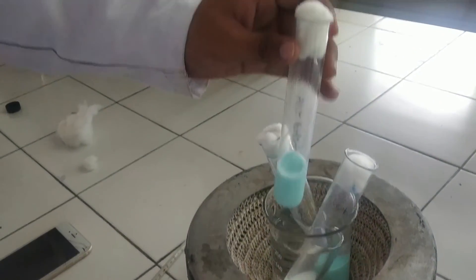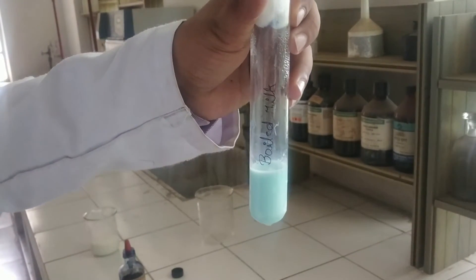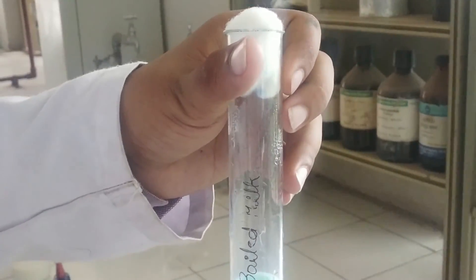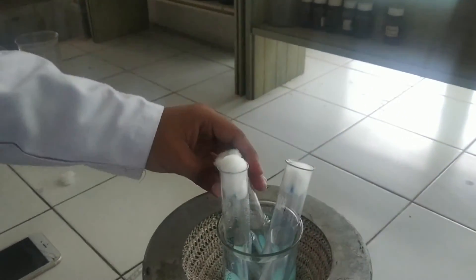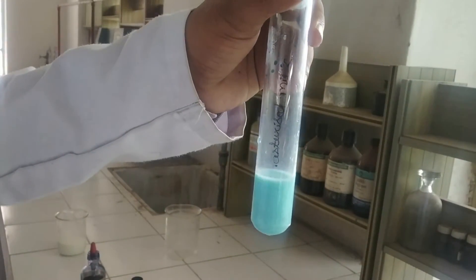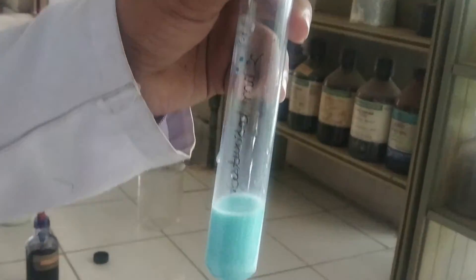The other sample is the boiled milk sample. The presence of slightly heat-resistant bacteria changed the color from dark blue to light blue in this boiled milk sample, meaning it is a fair quality milk sample. Now the third sample, which is the pasteurized milk sample: the color of the pasteurized milk sample has not been changed, so this is the milk sample which contains no microbes or negligible microbes, which cannot reduce the color of methylene blue, and the color remains blue.